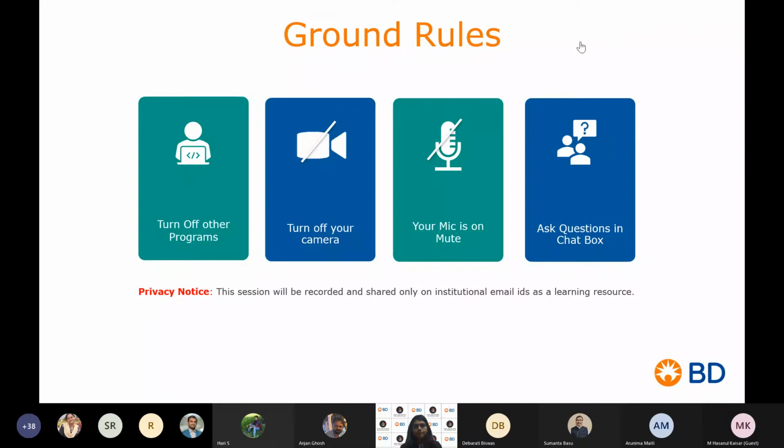Thank you, Ankita, and welcome all of you to this program on FlowJo. We are really overwhelmed by your participation and your registrations. The whole concept of this program came up after we conducted the previous program, where we got an overwhelming response when Anjan Ghosh conducted it. Looking at the response, we thought we need to get back with a detailed program on FlowJo.